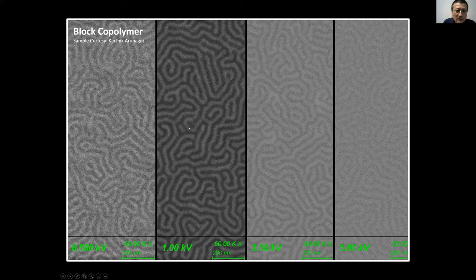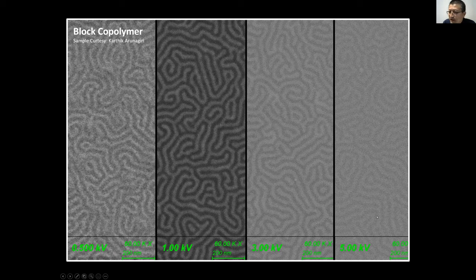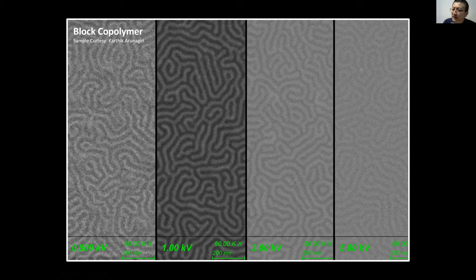Here's a polymer sample imaged at 0.5kV, 1kV, 3kV, and 5kV. At 5kV you can barely see the structure. At 1kV I think that's the best voltage — it gives you the contrast to see the structure clearly. Voltage plays a very important role when imaging a sample; it really depends on what kind of sample you have.